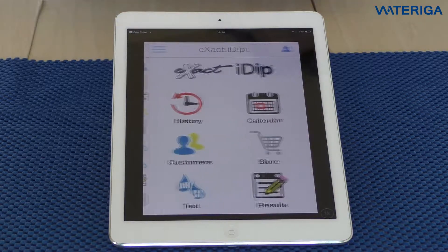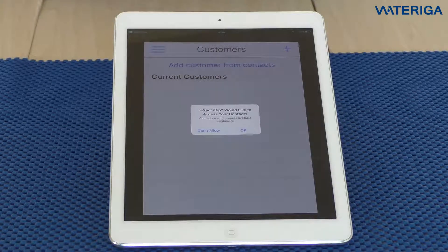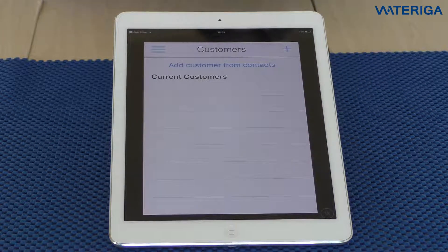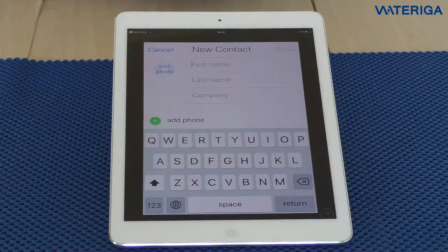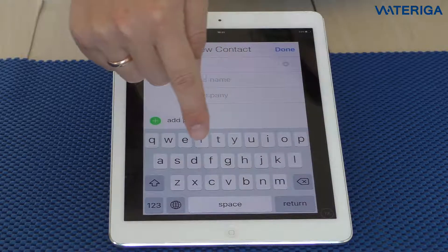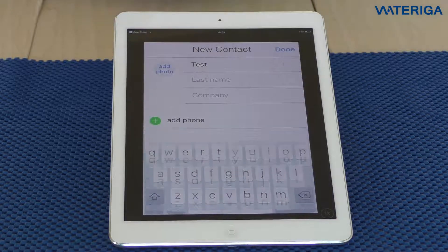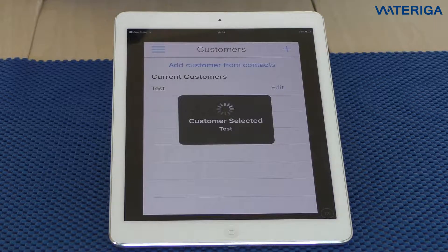Then we can go back to the home screen and set up a customer. Hit customers. It asks to access the contacts of your device — the i-Dip app will not store contacts directly in the app, so it needs access. When you hit OK, you can choose to add customers from your contacts or add a new contact through the app. We'll just choose 'test' as the customer name. One customer is now set up.